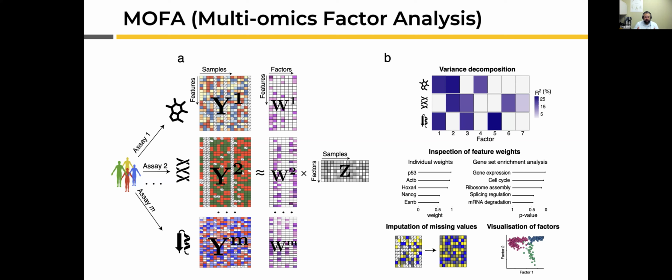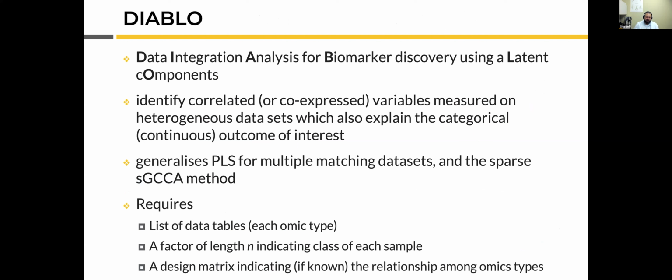And so you can actually run, and I didn't come up with this idea, this is actually from a great YouTube lecture. I should have included it here, but there aren't that many on multi-omics factor analysis, so if you search YouTube, it'll show up there. But the idea is that you run MOFA on all your data sets ahead of time, figure out the strength of relationship between them, and then take that information, go back into Diablo, and use the information from MOFA to create your design matrix before running Diablo.